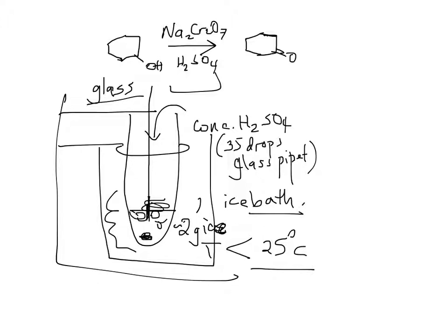Then add the alcohol—use the micropipette to take 502 microliters of cyclohexanol and slowly add it into your test tube. When you don't know what rate to add at, go slow—add drop by drop so you can monitor it. Continuously stir for good dispersal. Once the alcohol is in the acid and ice broth, we'll add the oxidizing agent. Make sure the temperature is less than 25°C.